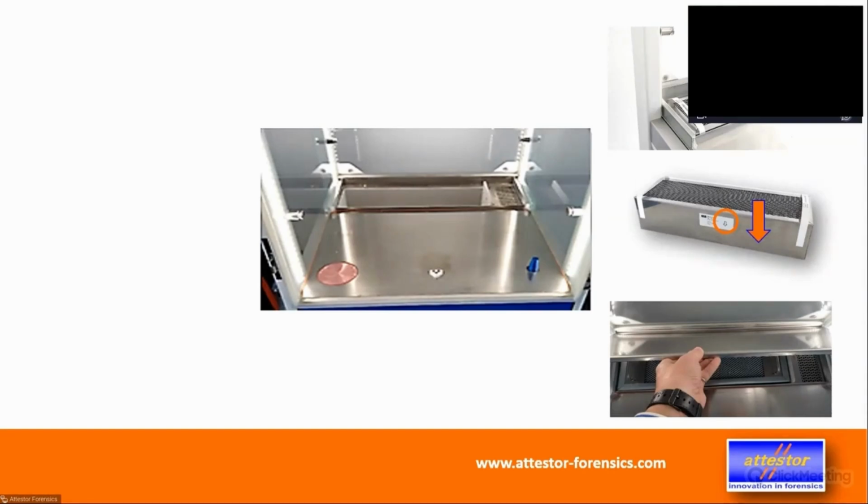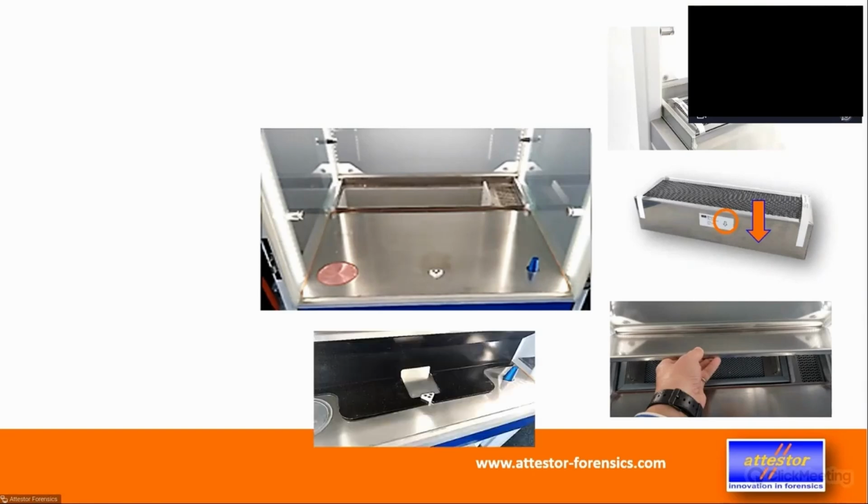The advantage too is you can also put something on there, absolutely easy. So it protects the filter a bit from having stuff sprayed in or spilled in or dropping in. And then in the front, for visibility reasons, I have made this from a black sprayed air guiding baffle, because that's normally also stainless steel.